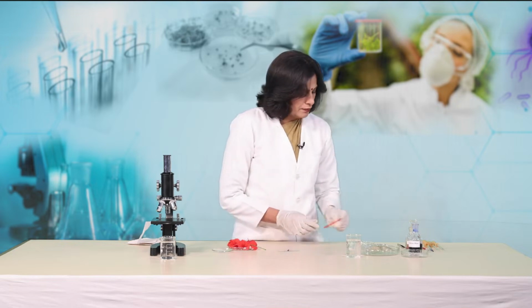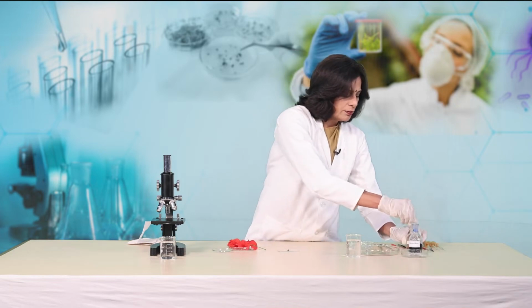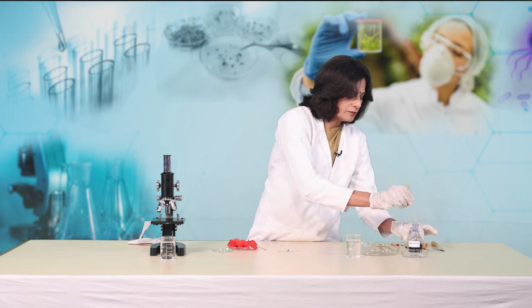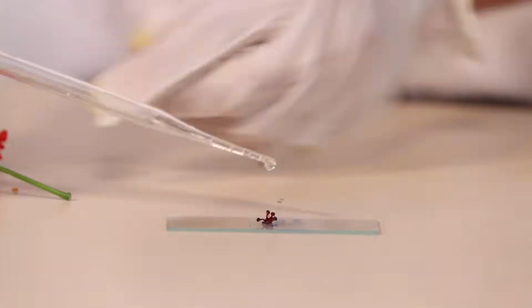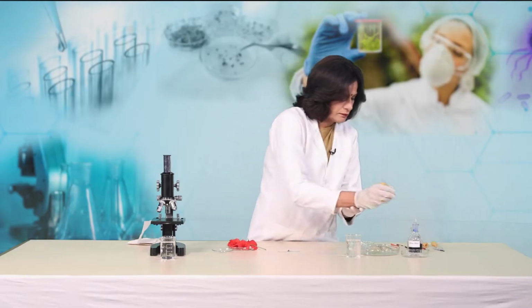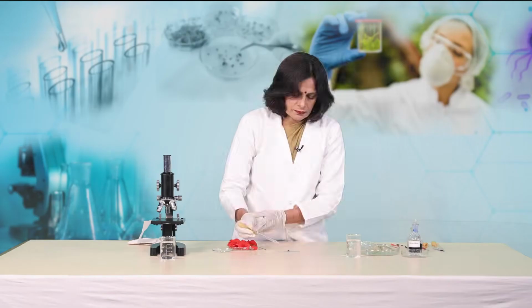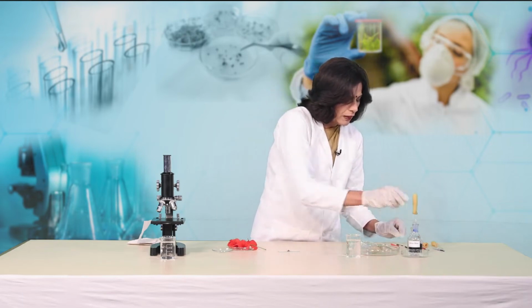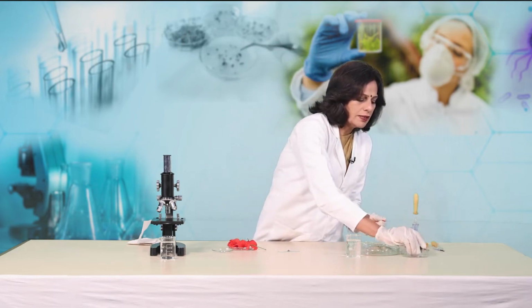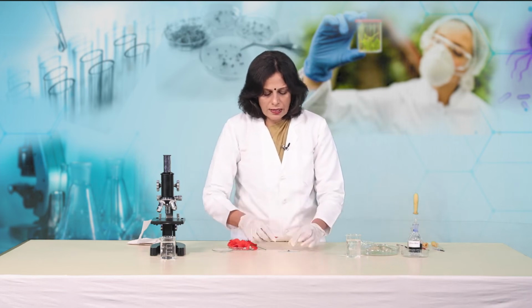So, we have removed the cotton blue stain. Now, we are going to put 1 or 2 drops of glycerine, which is the mountant. So, we will put 1 drop more of this glycerine, and now with the help of this needle we are going to lower down the cover slip very gently, so that no air bubbles are trapped.